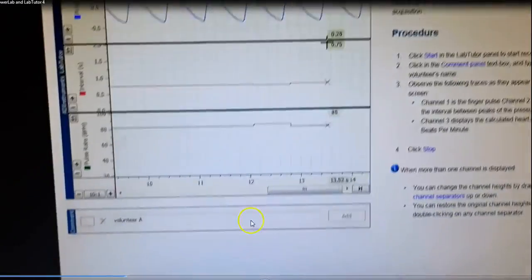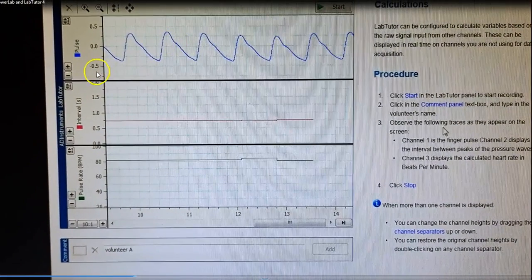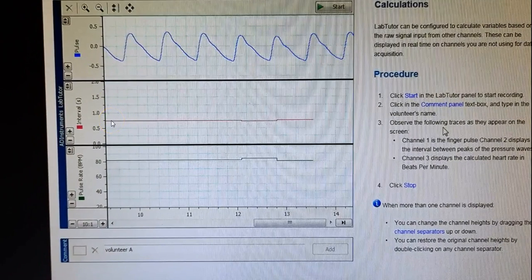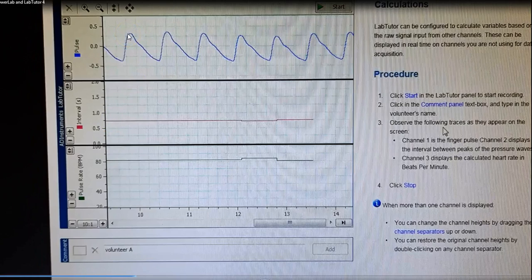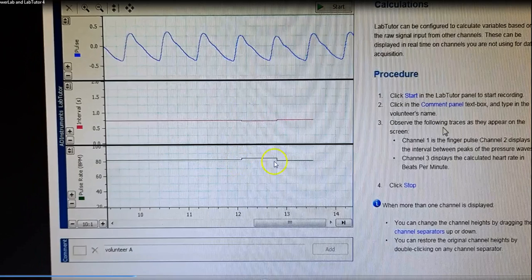So as you can see, in the waveform generated, the height, this actually pertains to the height, the height of your waveforms are almost the same. Sometimes it can deviate a bit, but that is human physiology. We're not robots. And then for the pulse rate, maybe I got a bit too excited, here on this part. But that's as excited as I am.